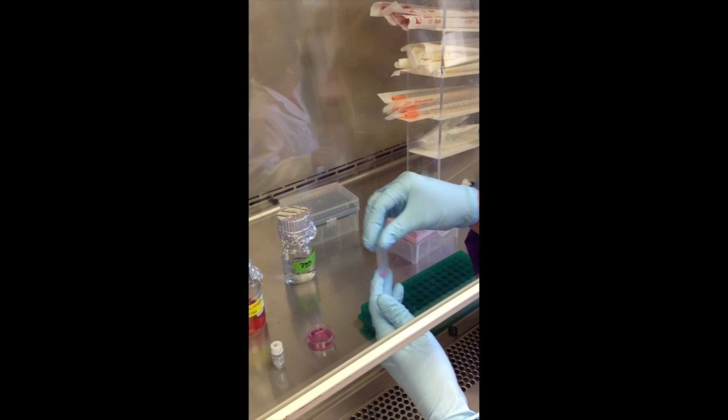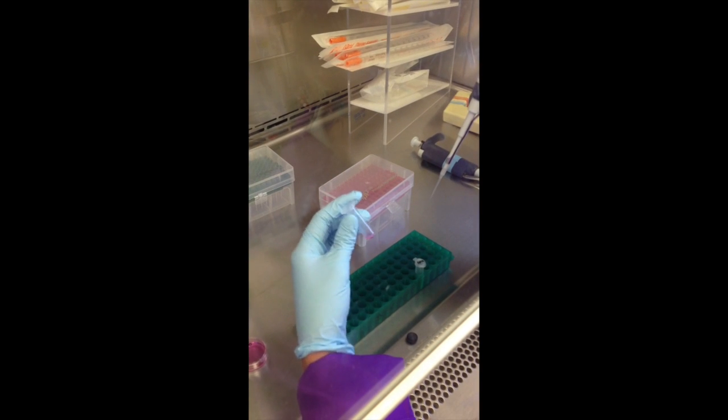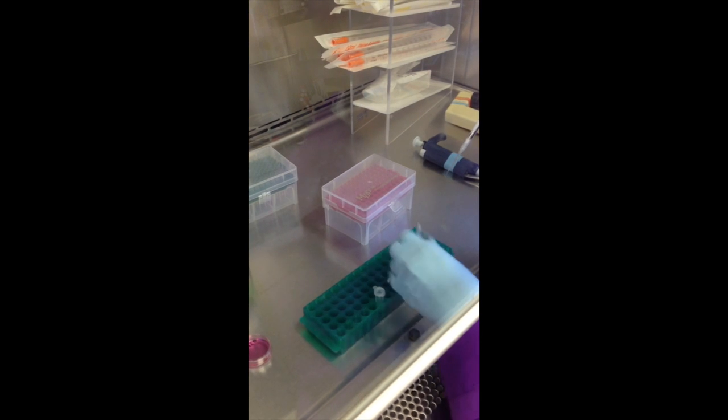The solution is then mixed and we have to wait for 10 minutes. So after 10 minutes, the next step is to add the DNA plasmid.